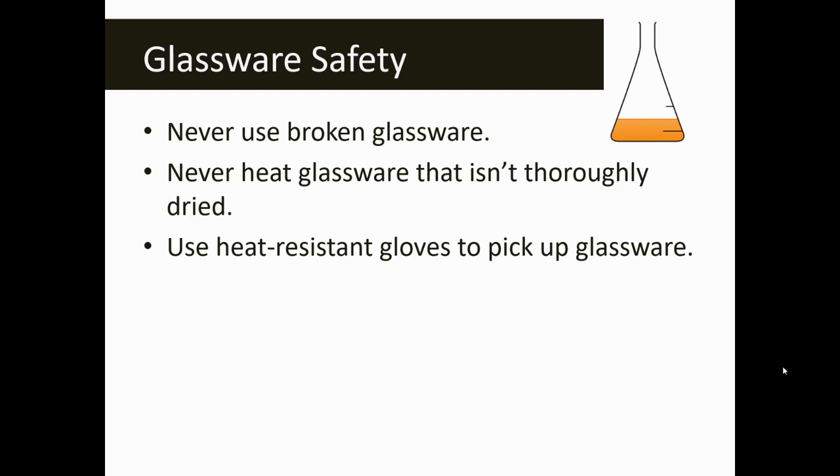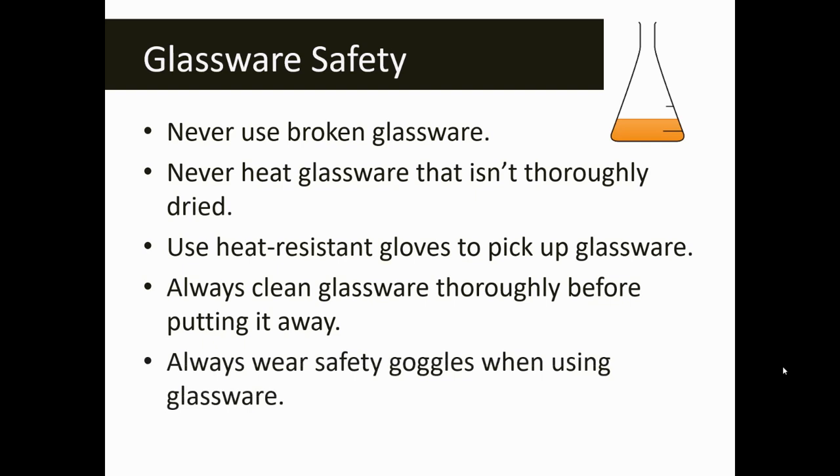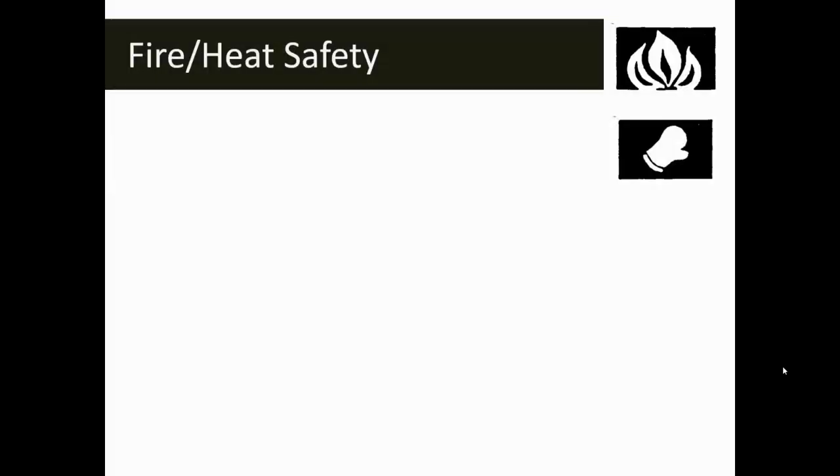Use heat-resistant gloves to pick up any hot glassware. There are also times where we'll want to use tongs or test tube clamps to transport hot glassware. Make sure that you always clean your glassware thoroughly before you put it away — clean and wash everything according to your teacher's suggestions. Make sure that you are wearing safety goggles anytime you use any sort of glassware in the lab.